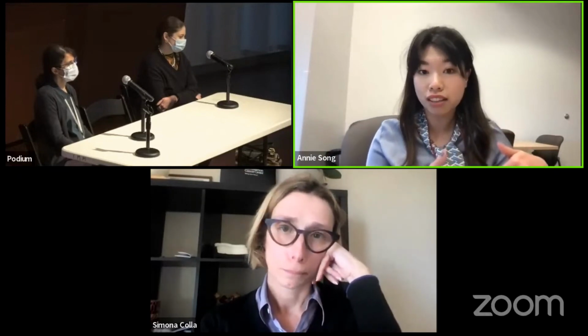Now, when I look at that inferred FCS file, it's worth noting that the way we have extrapolated this, the interpretation of the antibodies from sequencing to the antibody signal from flow, is a very complicated machine learning algorithm where we correct for the range and dynamic range of expression of each antibody. That's how we know where we should be putting the gate. And of course, everything you gain from the Infinity Flow needs to be validated with real life flow before you try to do anything else.